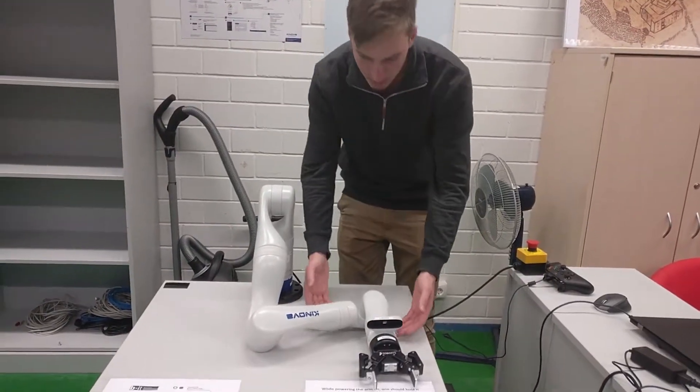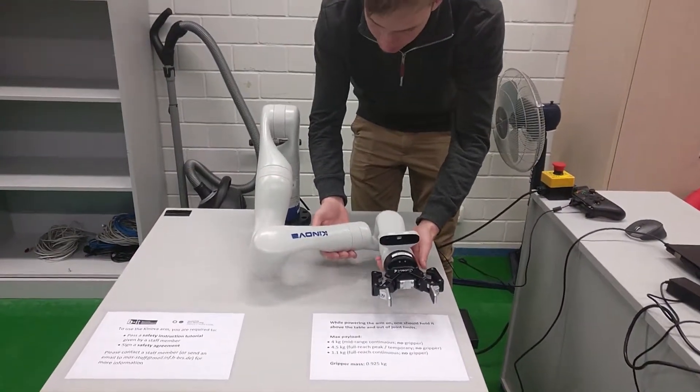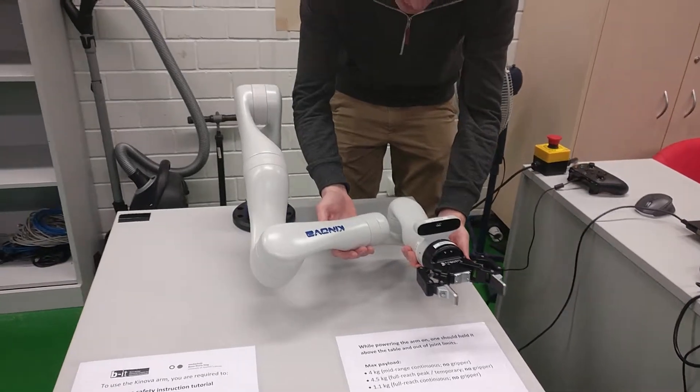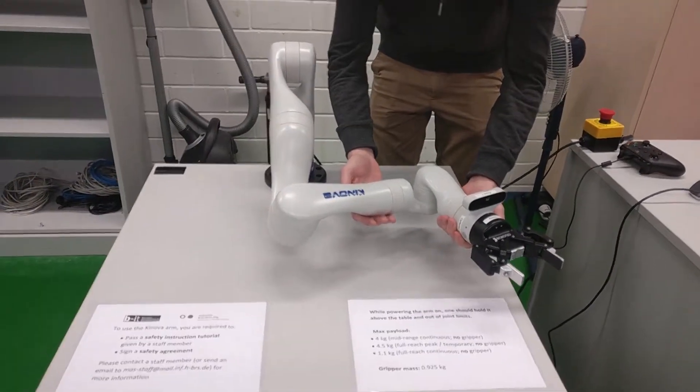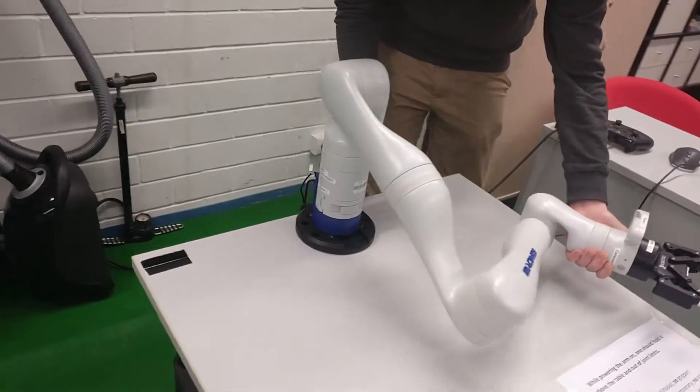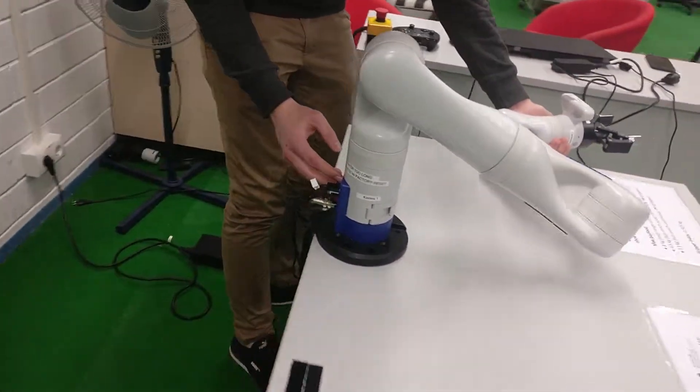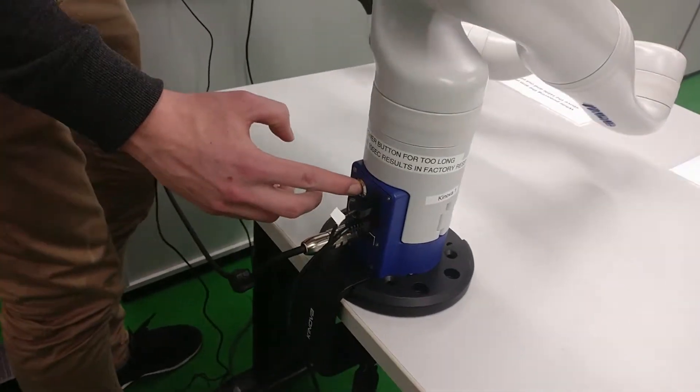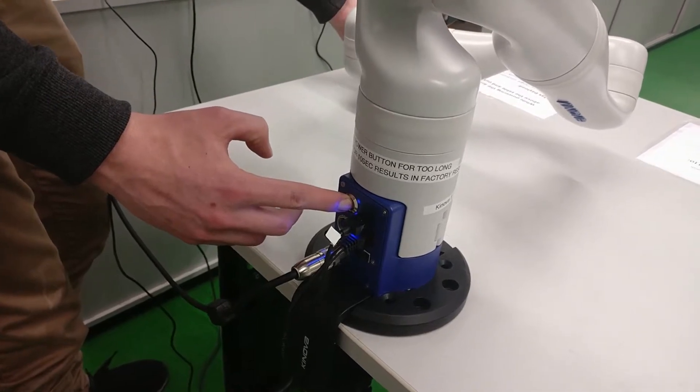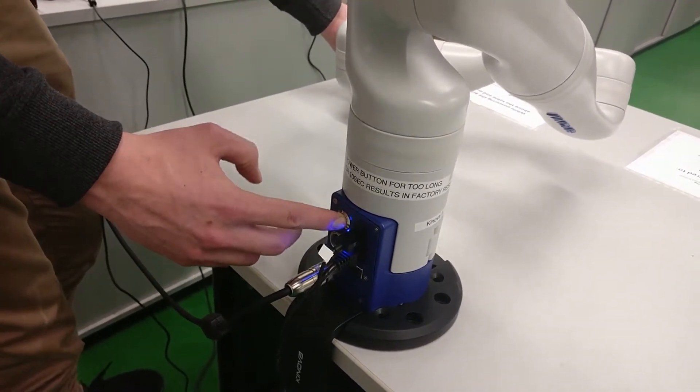When starting up the arm, you lift it off the table and make sure that none of the joints are at their limits. And then once you've done that, press the start button for three seconds. One, and two, and three, and release.